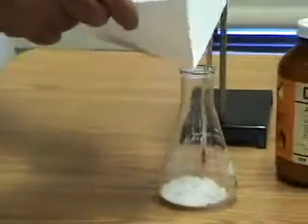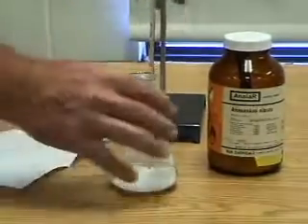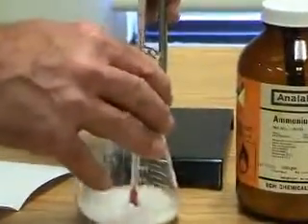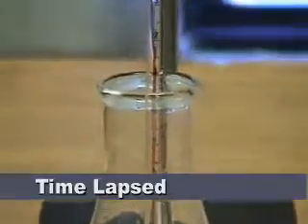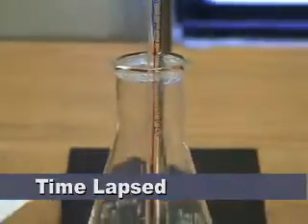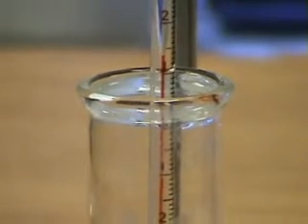Pay very close attention to the thermometer. These powders are both at room temperature to begin with. Pay very close attention to that thermometer as the reaction begins. We're going to take a look at the thermometer.